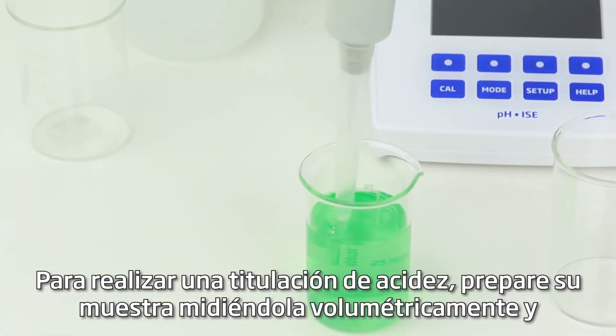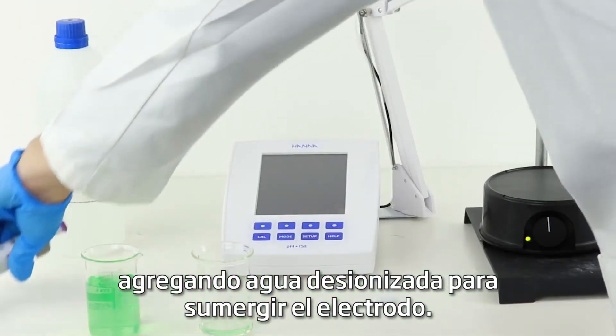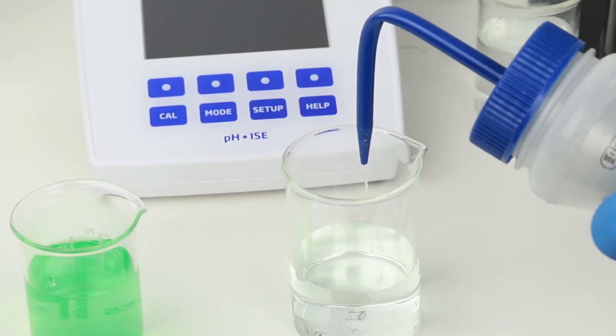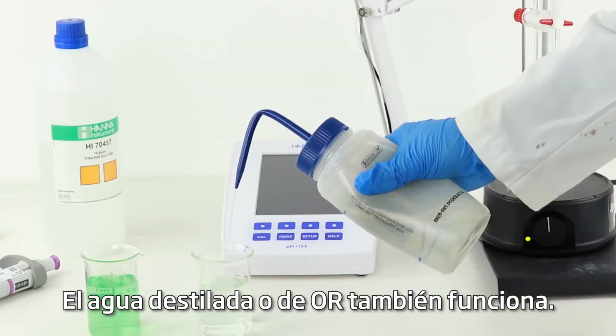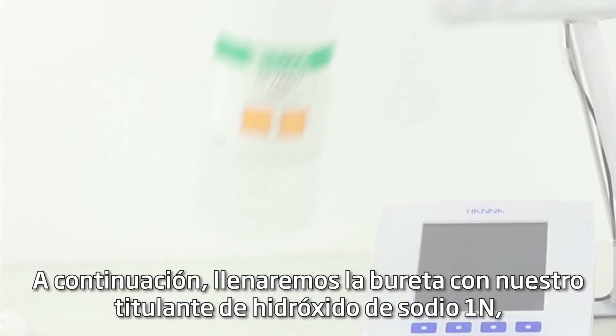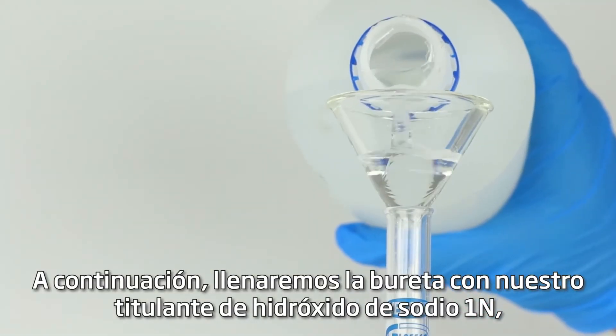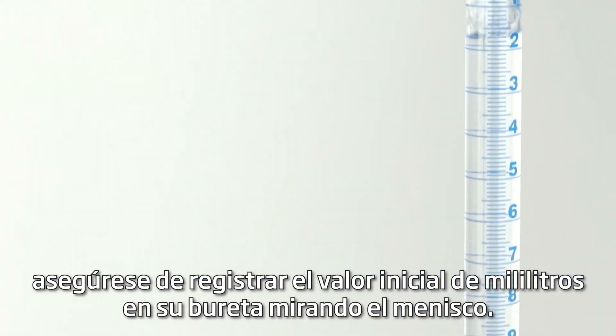To perform an acidity titration, prepare your sample by volumetrically measuring it out and adding deionized water to submerge the electrode. Distilled or RO water works as well. Next, we'll fill a burette with our titrant of one normal sodium hydroxide. Be sure to record the starting milliliter value on your burette by looking at the meniscus.